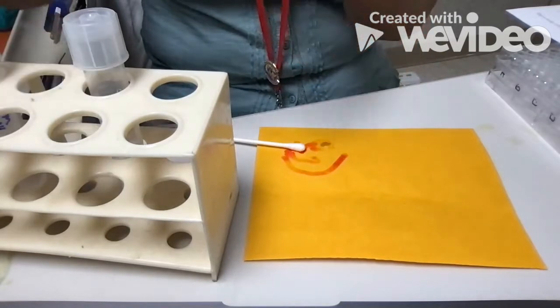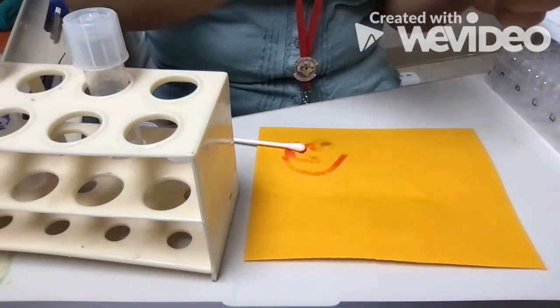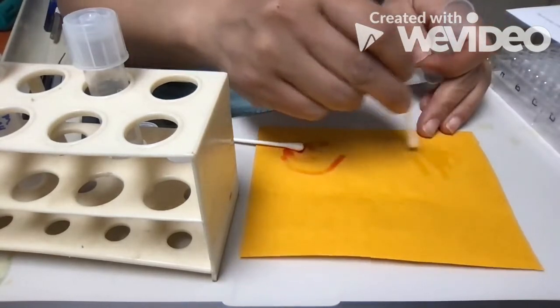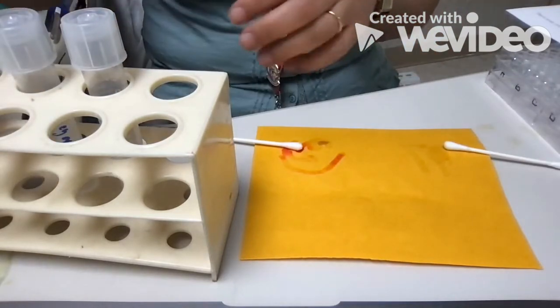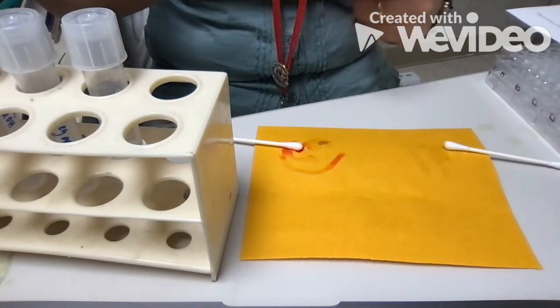My next solution is vinegar. Basically, nothing seems to happen when I draw with the vinegar. Next one is hydrochloric acid. Well, I guess we know whether this is an acid or not.